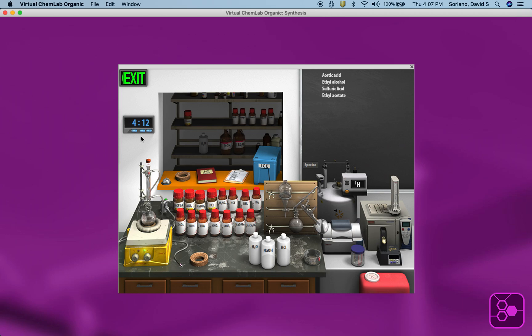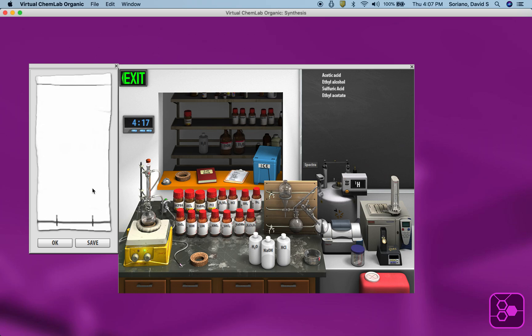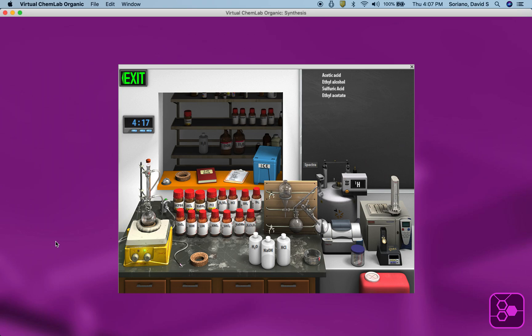And we'll just let that run. I can adjust the time on the clock. I can do infrared, mass spec, distillation, all these other things. I've been working with this just for about an hour now, trying to refresh my memory. It is a very impressive program. There's general chem and other experiments, but there's a wide variety of organic reactions — the types that students learn in beginning organic. You can do qualitative analysis and identification.